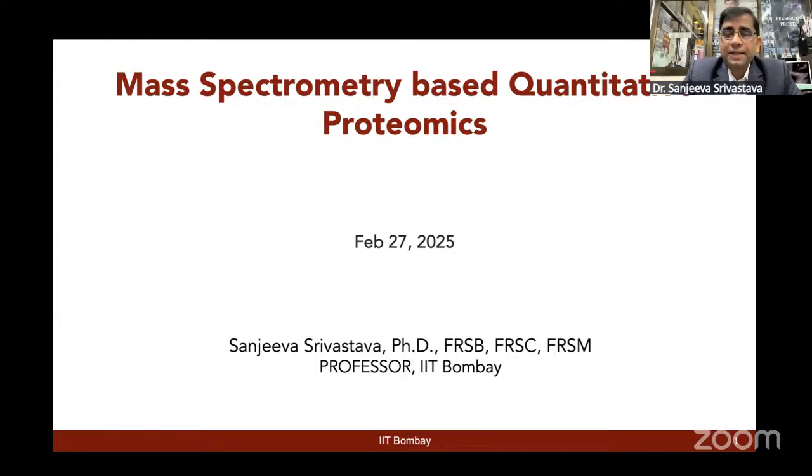Today we are going to have this live session about mass spectrometry-based quantitative proteomics. As you are aware, for most of our biological problems, we want to compare some conditions, right? For example, how a disease condition is different than the healthy condition, or how a drug treatment can induce some proteins in response to that given drug, or because of a given stress condition, or any kind of thing which you want to test out. We always look at quantitative changes, right, at the proteome scale.